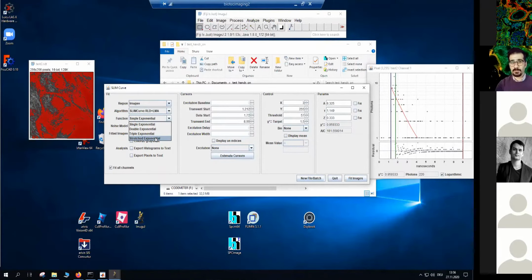an incomplete decay curve, when we have a high laser repetition rate and the decay is not finished in time, so it's incomplete and the fluorescence is not completely decayed, and we might use this stretch exponential. But this is what I guess. So if I'm saying something wrong regarding that, and anybody has actually used this one and knows, just unmute yourself, hop in, and say some words about that.